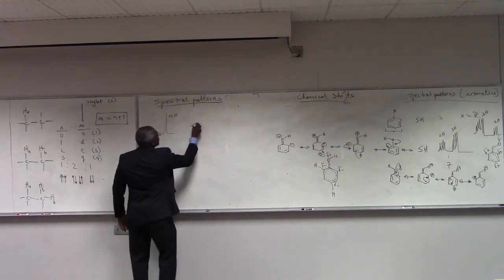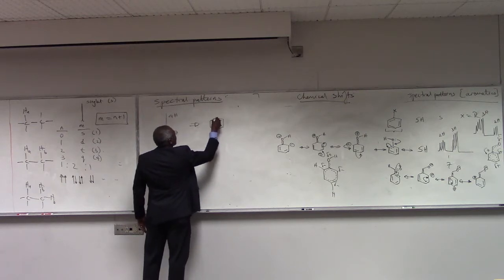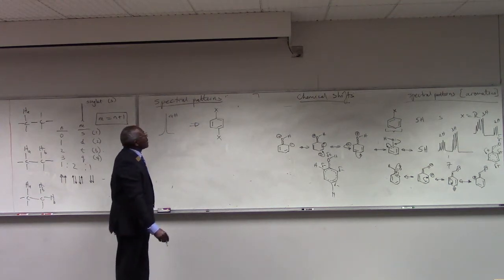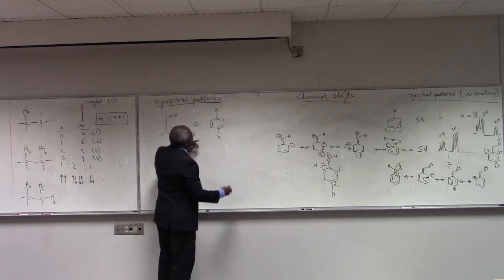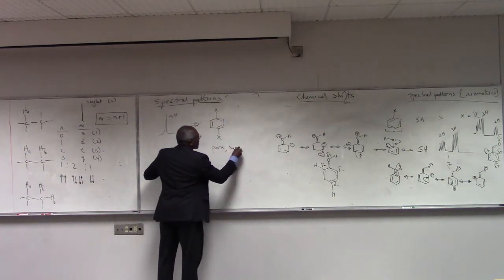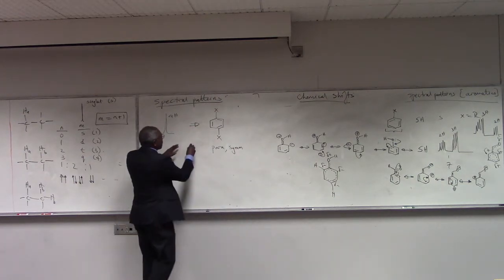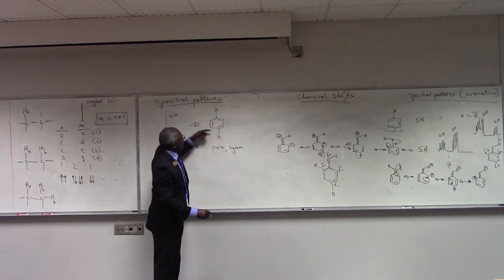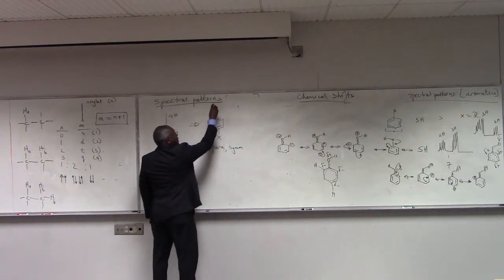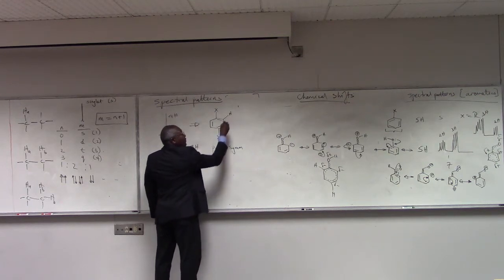What that implies is you're dealing with a di-substituted ring which is para and symmetrical. So it's called para-symmetrical. Some people say para-sim. And the reason is that obviously it will integrate for 4 H's because I've got 1, 2, 3, 4 H's. But because this molecule is symmetrical here and here, all of the H's are equivalent.